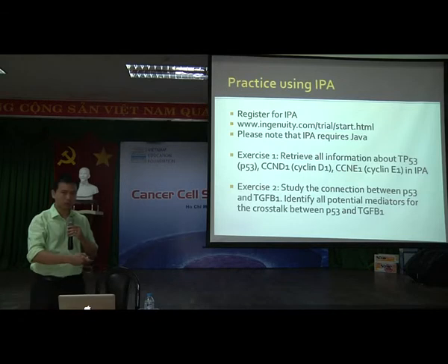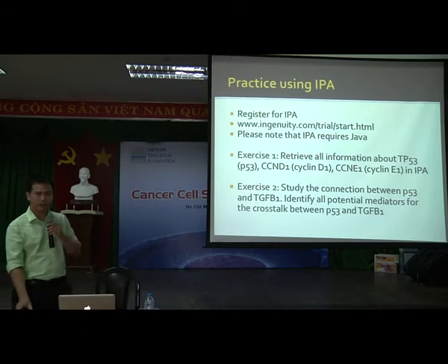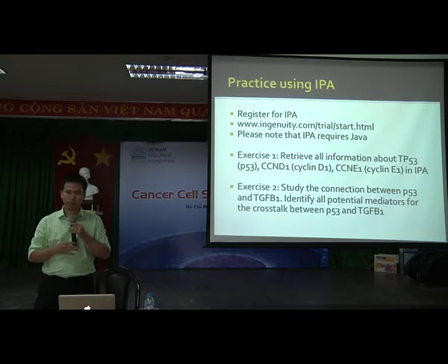Okay, so for those who have not logged into IPA, please do it right now. And for those who have already gotten access, please turn on your IPA, and we're going to practice right now.